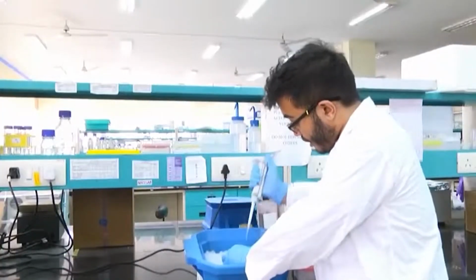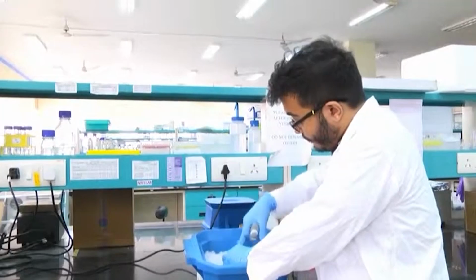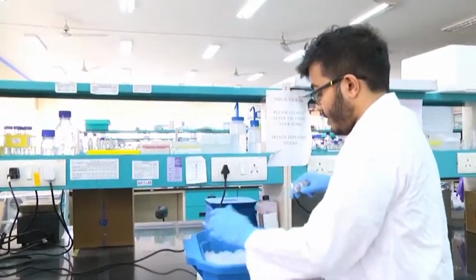I will just open this vial, and keeping it embedded in ice, I will just add the DNA and I will thoroughly mix it, give it a gentle swirl, close it and leave it in ice. Make sure it is cold. So, now what is happening is, I will just cover this.